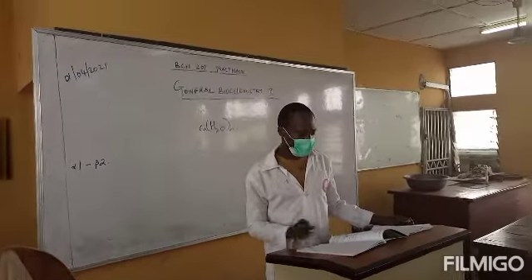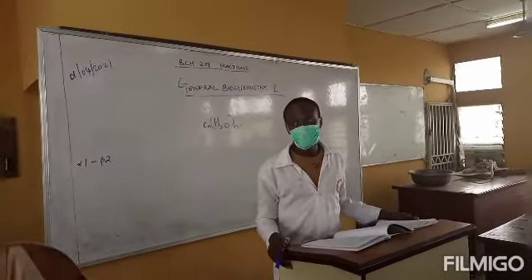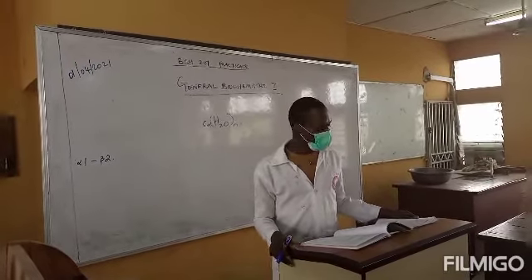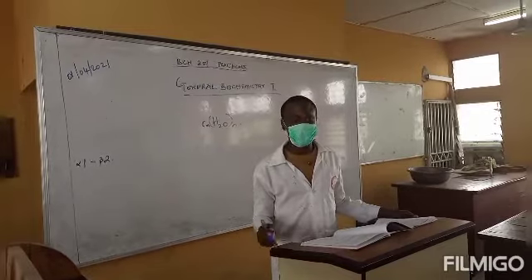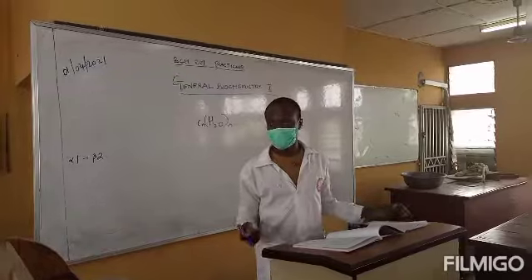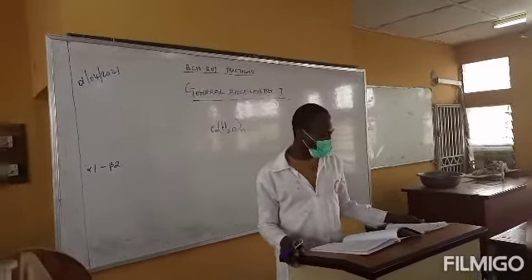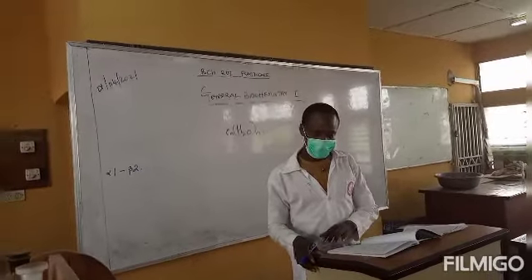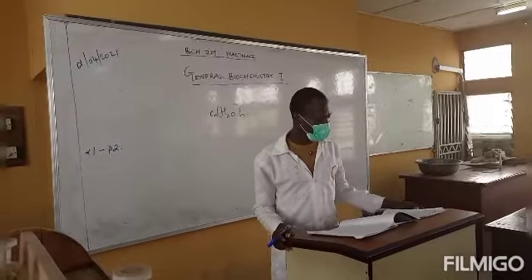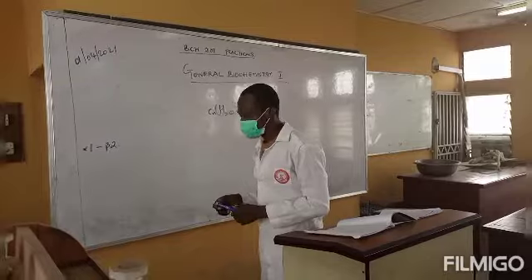So today we are not going to digress from what we have been talking about. We are going to take some tests, as was introduced by my senior colleague. The first one, the Molisch Test, then the Benedict Test, and then the final one, we are going to test for sucrose. So the first one we are going to take is the Molisch Test.